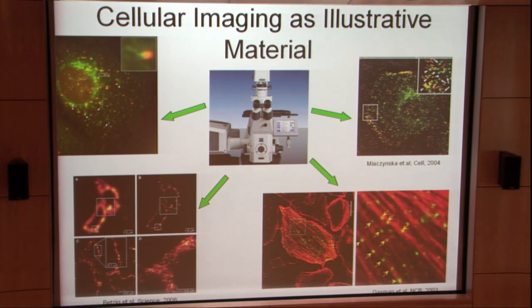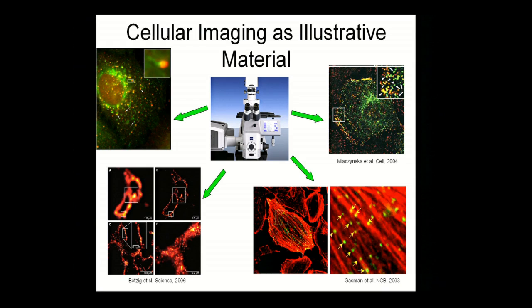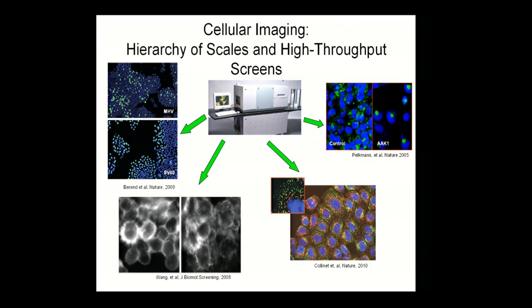Okay, you see this is very blurred. But if you go to super resolution, to PALM, then you see it with very many structures. So this is just improving or presenting data which are visualized at the beginning. And this is generally, let's say, a little old style, classical style, but still a quite working style in microscopy.